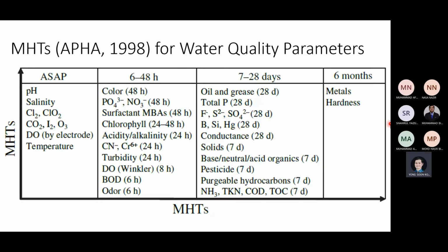Oh, by the way, why this is also important? Because when we're involving court case, this has to be strictly adhered. Because like I said last time, when there's a prosecution, the lawyers can easily say that, oh, your sample did not follow maximum holding time and therefore they are like invalid.